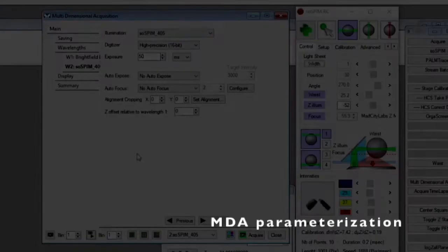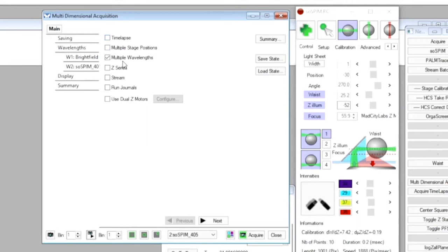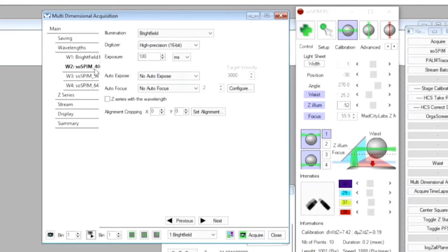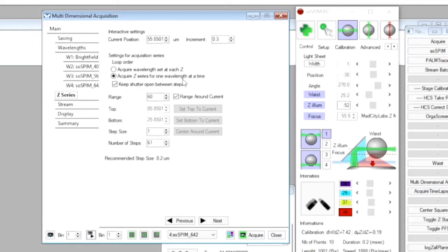Now we have to parametrize the multidimensional acquisition tool to perform a multicolor 3D acquisition. We select multi-wavelength, Z-series, and the stream option. The stream option enables acquiring the 3D volume as fast as the camera allows. We then select the wavelengths we want — brightfield for single planes and 3D acquisitions using excitation at 405, 488, and 640 nm to image the DAPI signal, the SOX2 signal, and the actin signal respectively. We then define the 3D volume we want to acquire, here a volume of 16 microns around the current position, stepping every 1 micron. In the stream tab, we ask to perform a stream in Z and to use the user program SOSPIN. In this configuration, all the light sheet positions required for 3D acquisition are computed before the acquisition process.